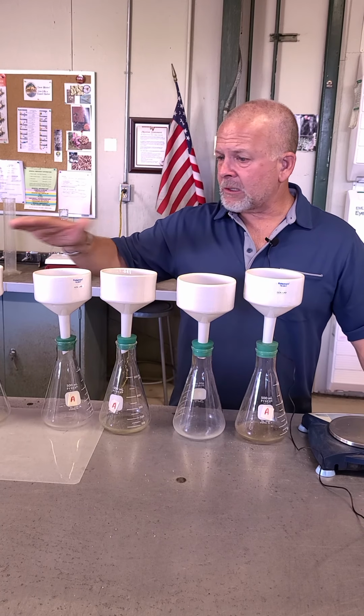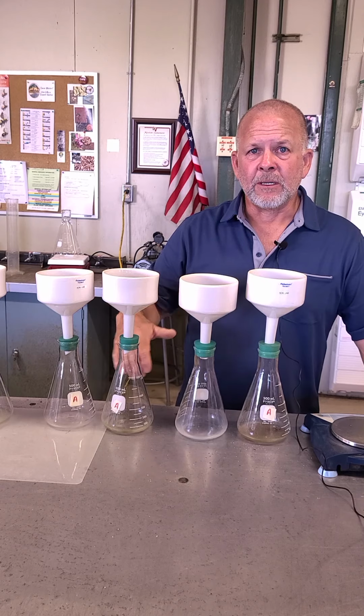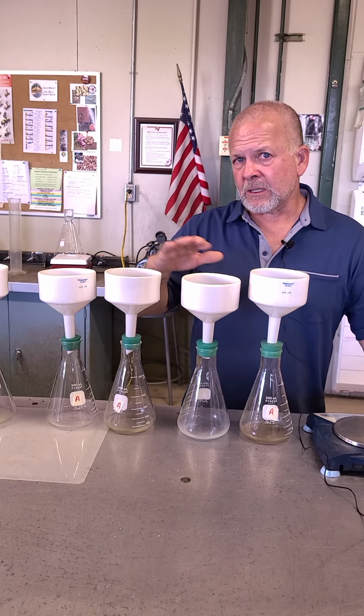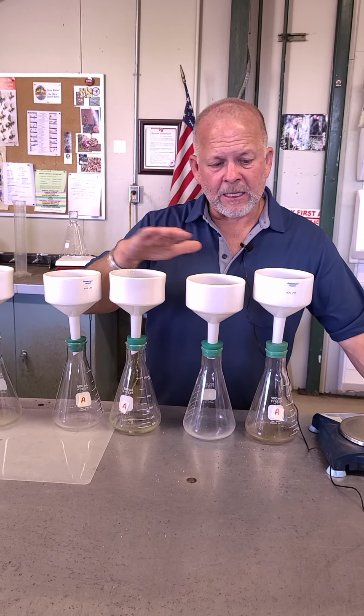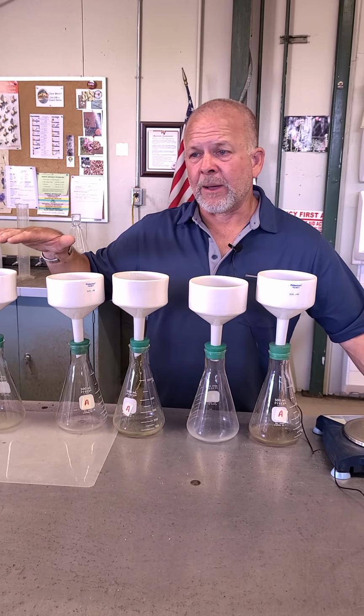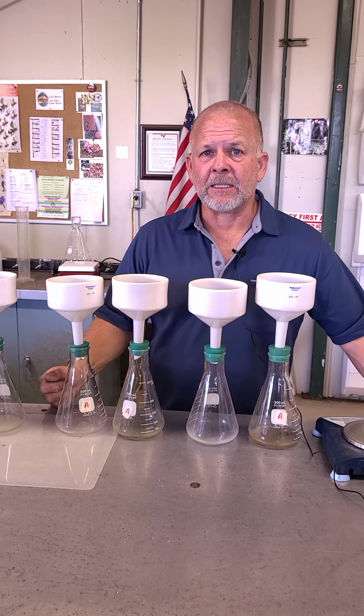So having done that, you can see we've tried to make these funnels as level as possible, so that the water will be sitting in there. So we're trying to eliminate any variables in our experiment. So we'll let these things drip a little bit, then we'll come back with the water all filled up, and we'll talk about the next stage.